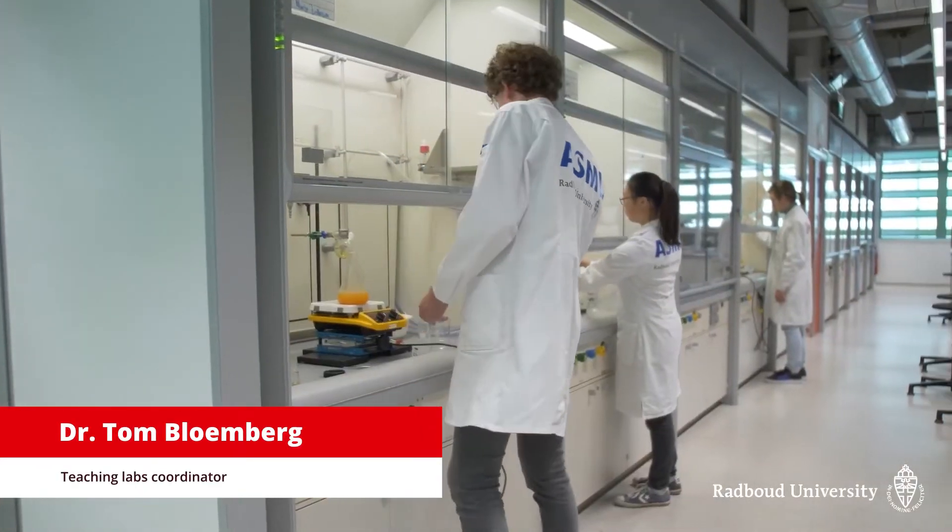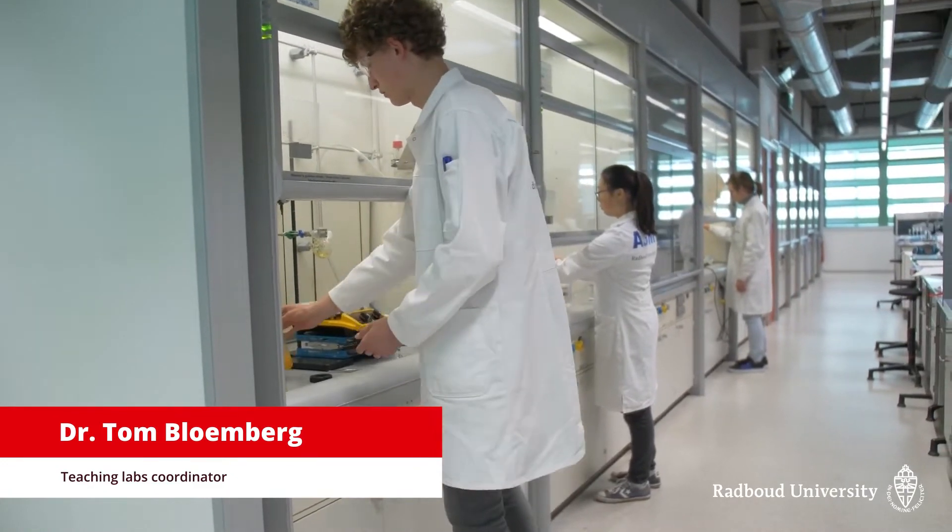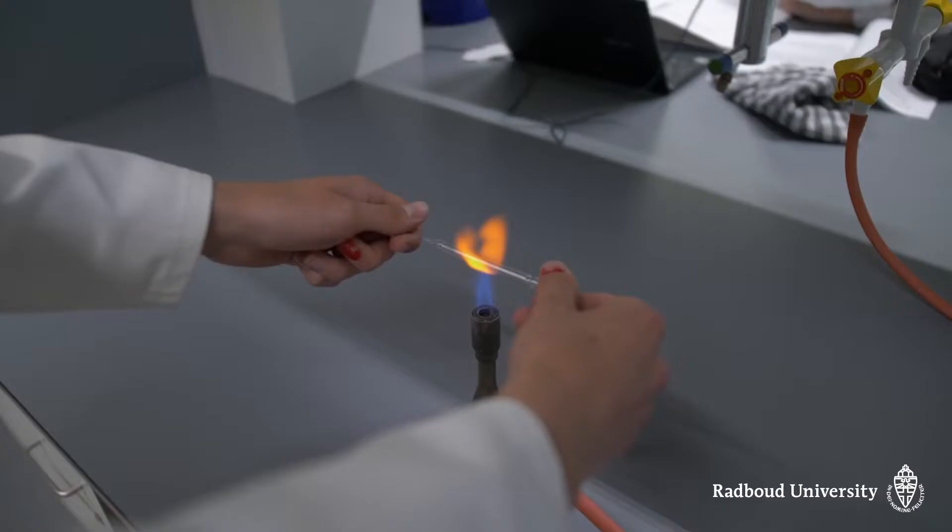Welcome to the Molecular Sciences Labs at Radboud University. This is where the students in our programmes Chemistry, Molecular Life Sciences and Science do their lab courses.